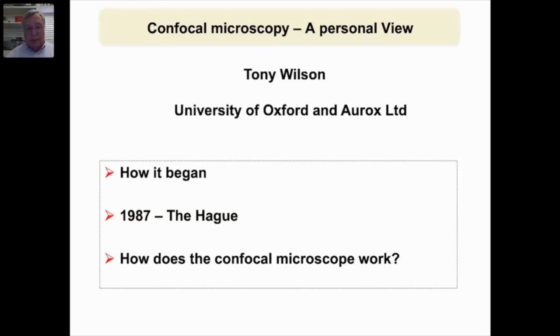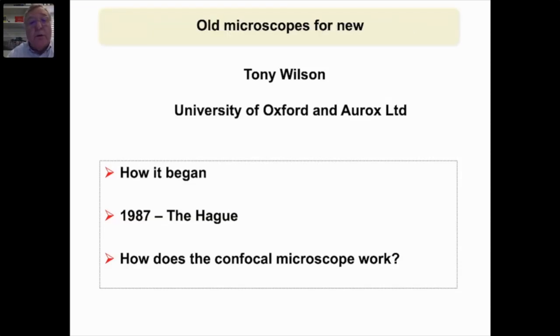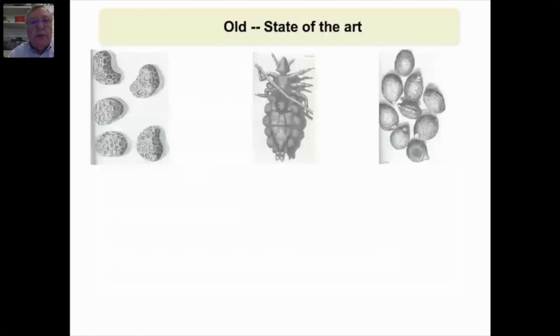And the other thing I want to emphasize as we go through this is that I started off believing I knew how the confocal microscope worked, and then pretty quickly realized that I didn't really, and it was much more subtle than I had first thought. So it's a purely personal view, and it's really trying to sell you old microscopes for new, if you like, children's pantomimes. So you have to be able to at least do as well as people could in the past.